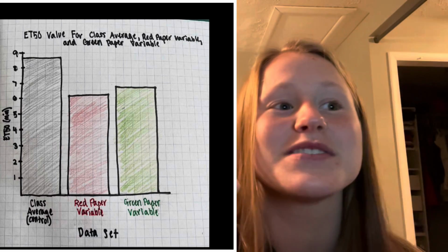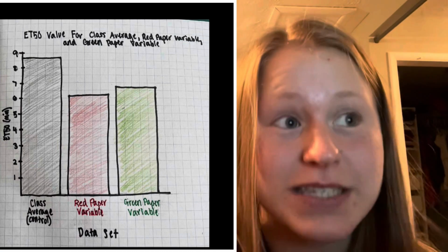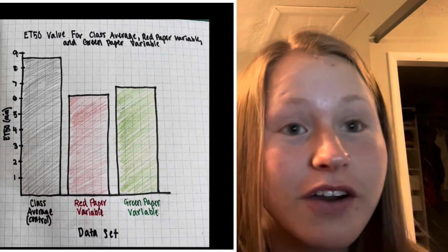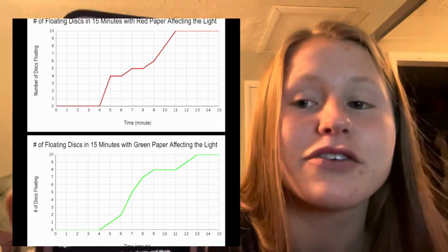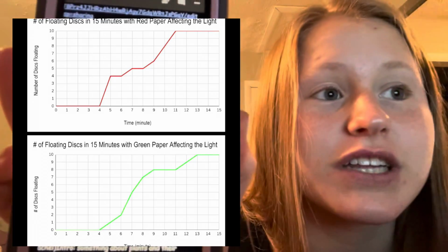And in these 2 graphs with the different colors, we are able to tell that the red is the superior color for these spinach leaf discs and their efficiency with photosynthesis. The red starts off quicker with a steep incline with 4 discs floating in just 5 minutes, as pictured in the top graph, compared to the green's weaker performance with just 2 in 6 minutes. Unfortunately, for this experiment, the green will be the one that has to return home as a loser, but the red will celebrate as it remains victorious with its efficiency of photosynthesis. And now, our next person will take it away.